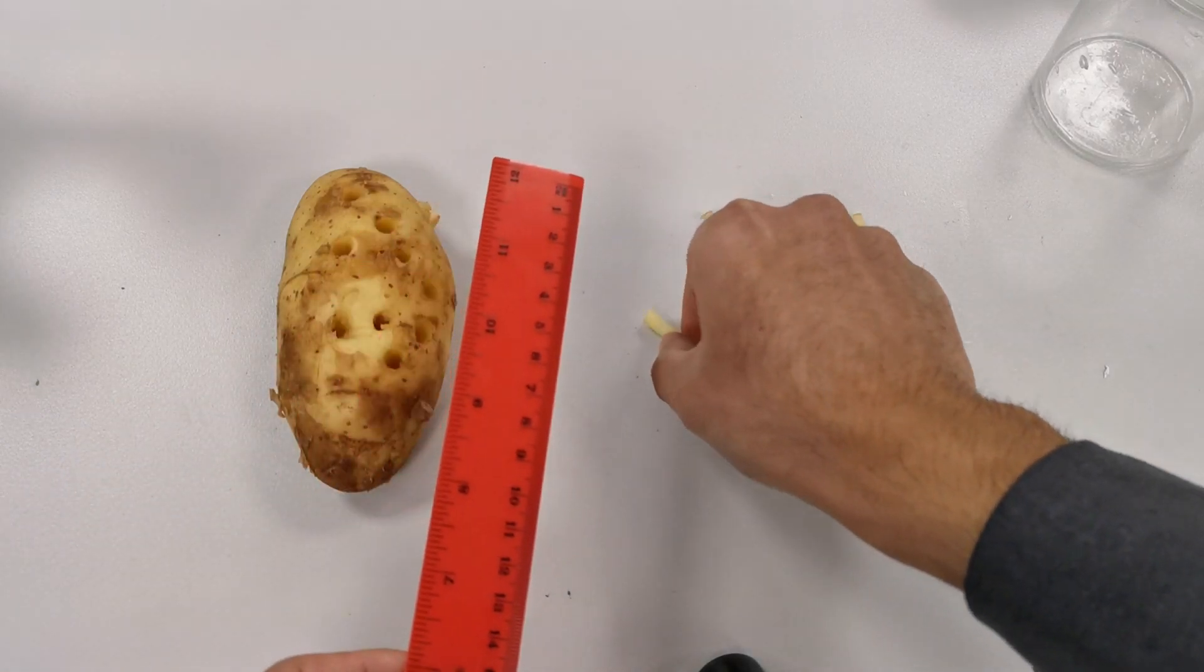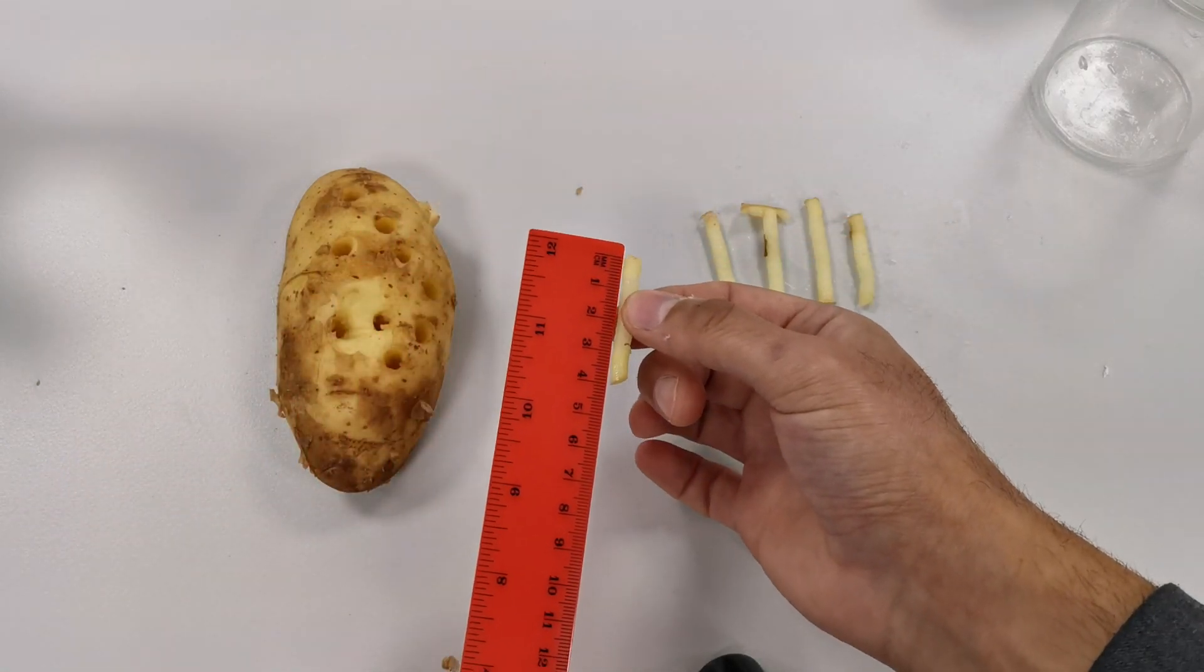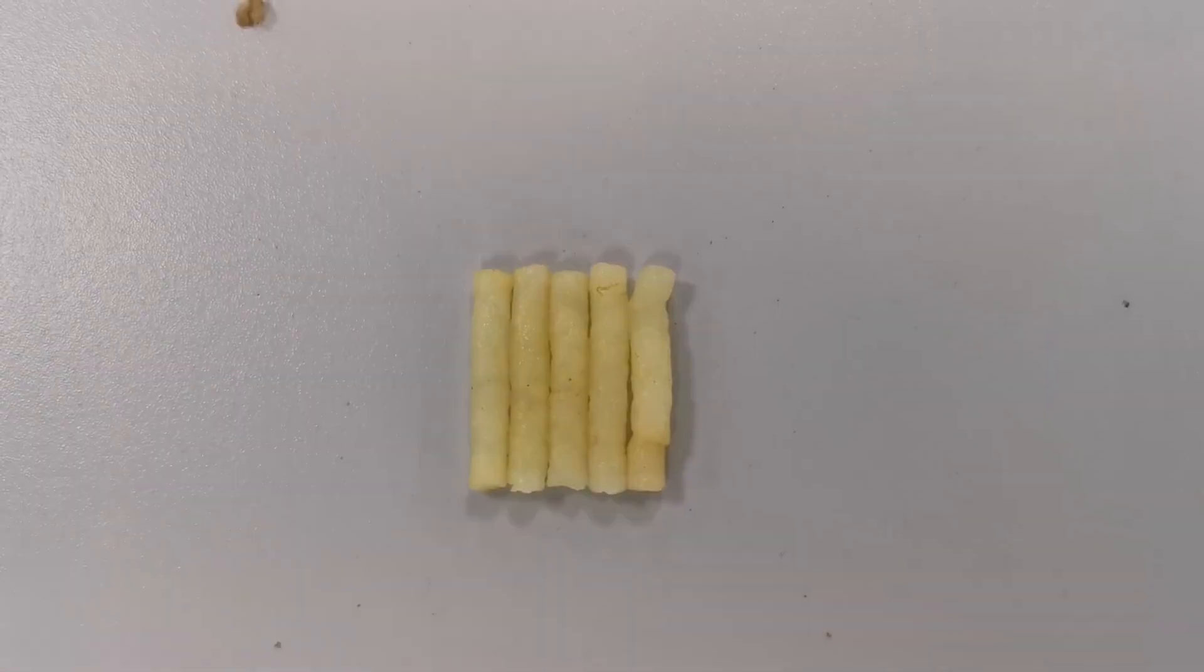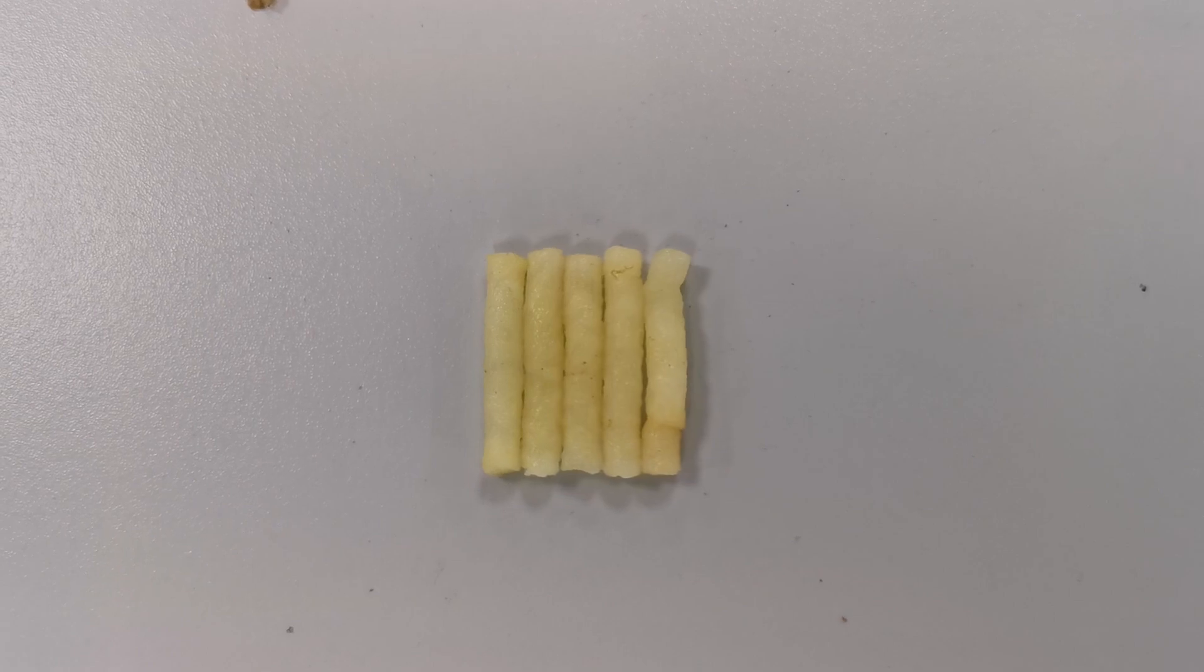Now I'm going to cut the cylinders to make sure they're all the same length. I'm going to make mine approximately three centimeters in length. Now all of the potato cylinders are the same length.